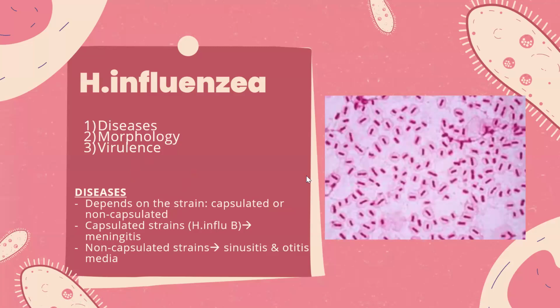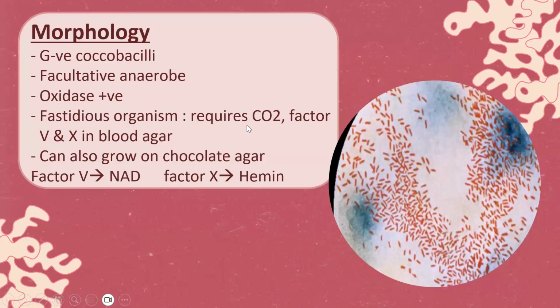Okay, so this image is of H. influenza, but this obviously has a capsule. It will not cause otitis media. It will cause cases like meningitis. Okay, so only the non-capsulated strains of H. influenza will cause otitis media and sinusitis.